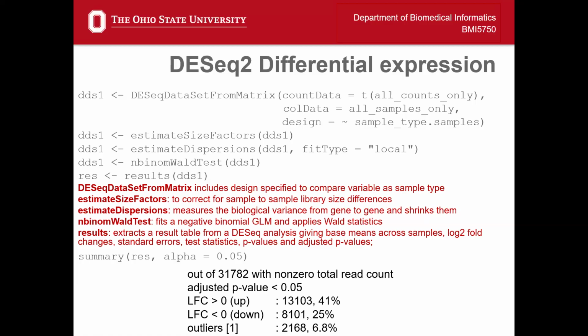With a tumor normal setup, we want the tumor to be our primary group and the normal to be our secondary group, our control group. And if we didn't set the levels of our factor, it would be switched around because normal comes before tumor in the alphabet. So be sure that you're always setting your factors to what you want them to be.